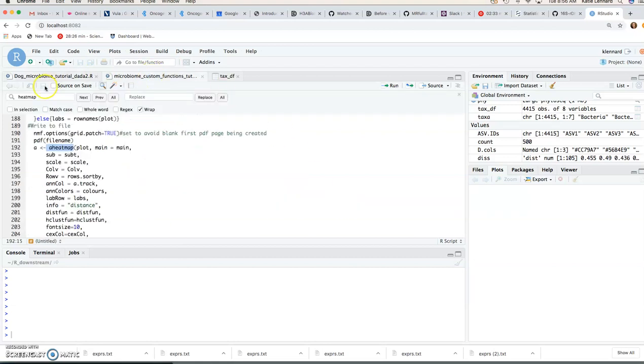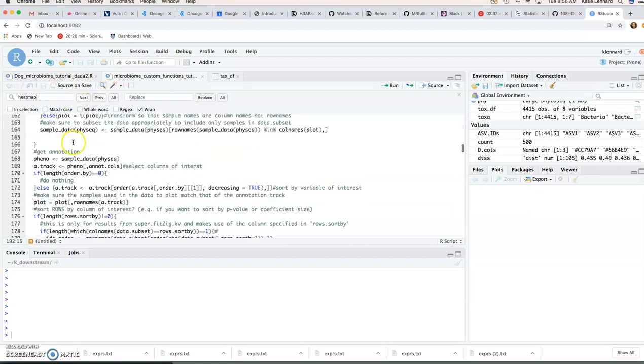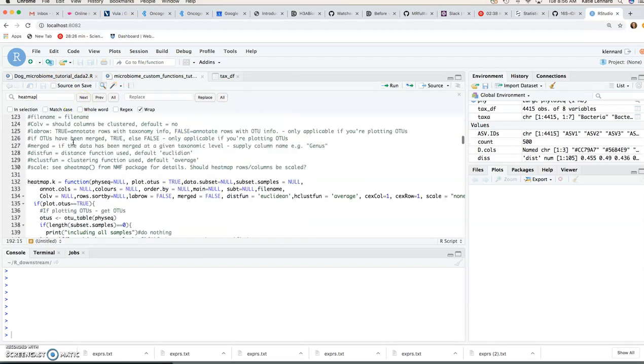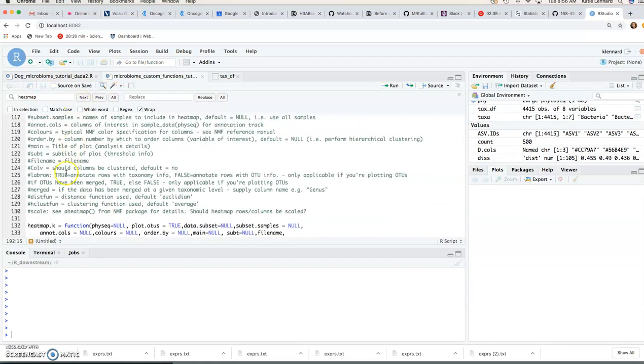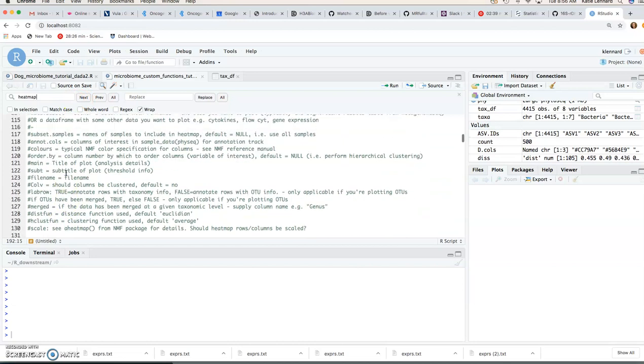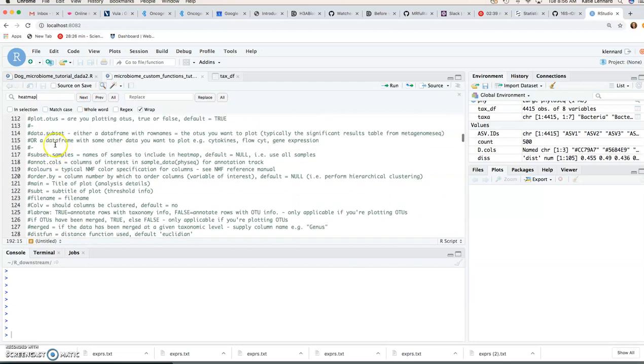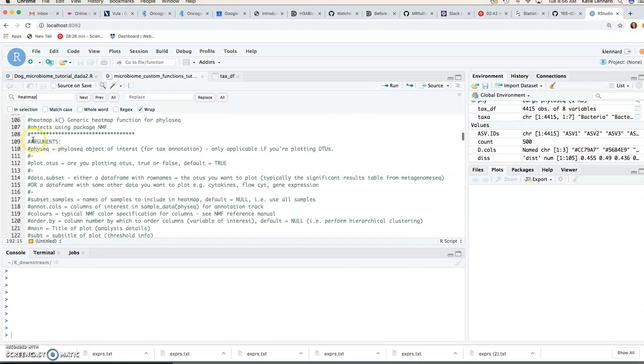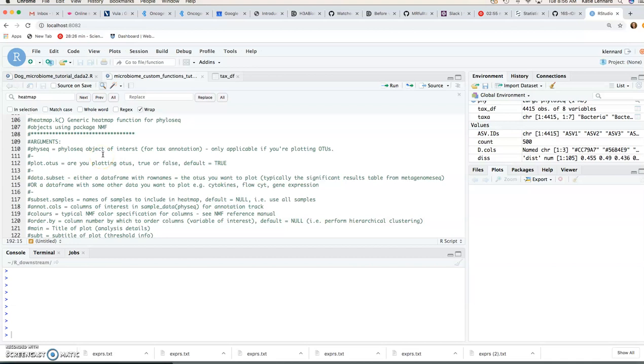So let's just have a look at what it looks like. If we look at the function you can see from around line 109 it describes the arguments that we need. So the phyloseq object is our input and then there are a number of parameters that we can specify. Some of them have default values, some of them you have to specify.